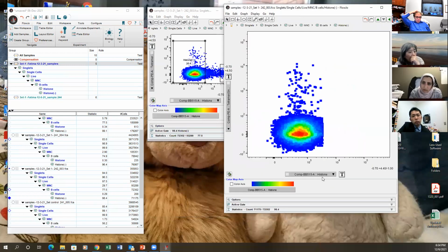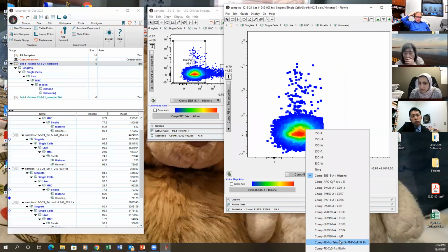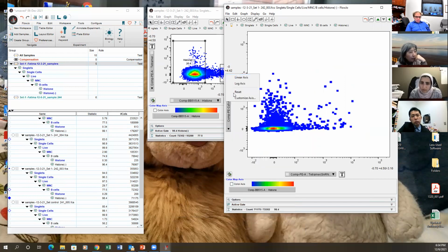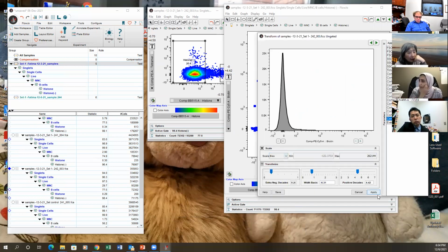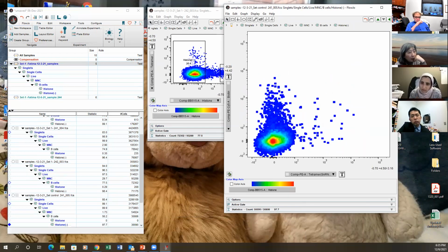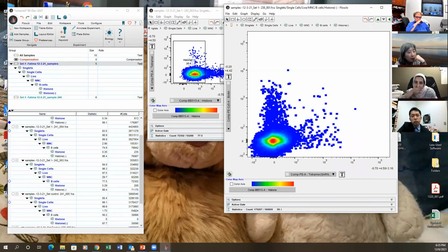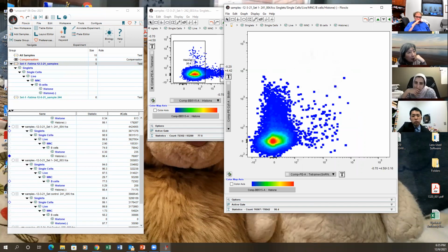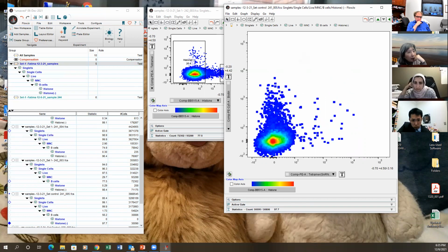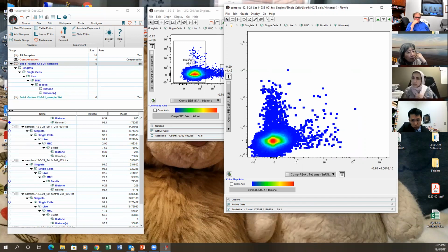And this one, I think we're going to look at tetramer and the biotin. But I think this will have the same problem. Let's see. Okay, well, actually less of a problem. Yeah, this doesn't have so much stickiness. Right, this is tetramer. That histone always gives some problem. Yeah, exactly. I don't like the histone because of that.